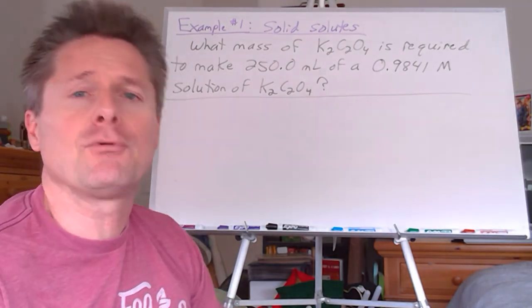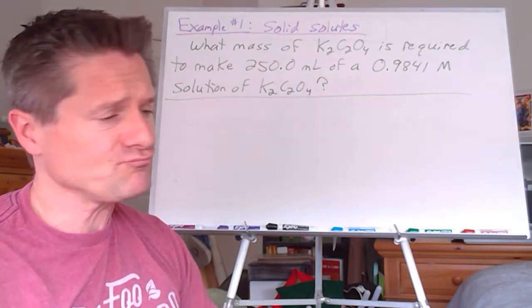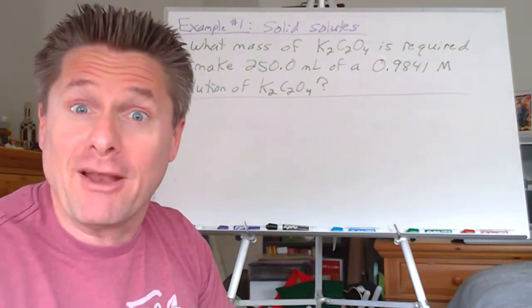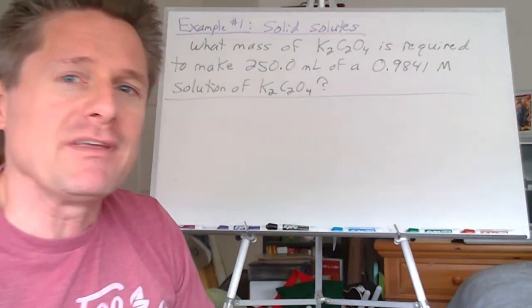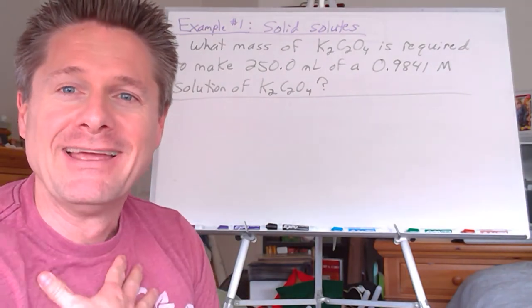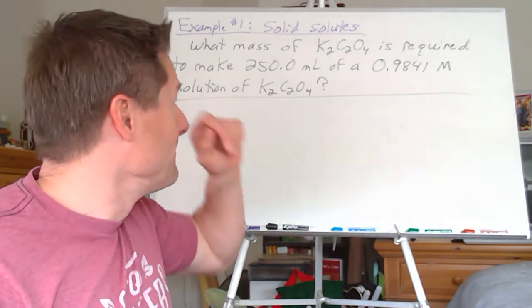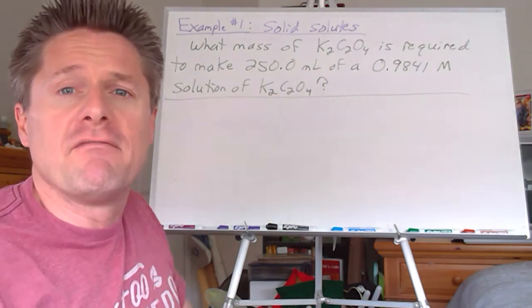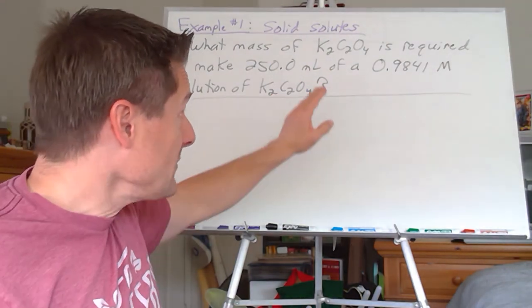So you go back in the stock room, go to the shelves in your general chemistry laboratory, and you'll find jars of it. And remember, never stick your finger in there. Don't stick, exit holes only. Don't contaminate it by shoving something in there. So follow the laboratory techniques properly to not contaminate your solutes. I see the weirdest things in lab, I'll tell you. And it may be phrased differently, but this would be a valid theoretical quiz or exam question. So how do we figure this out?